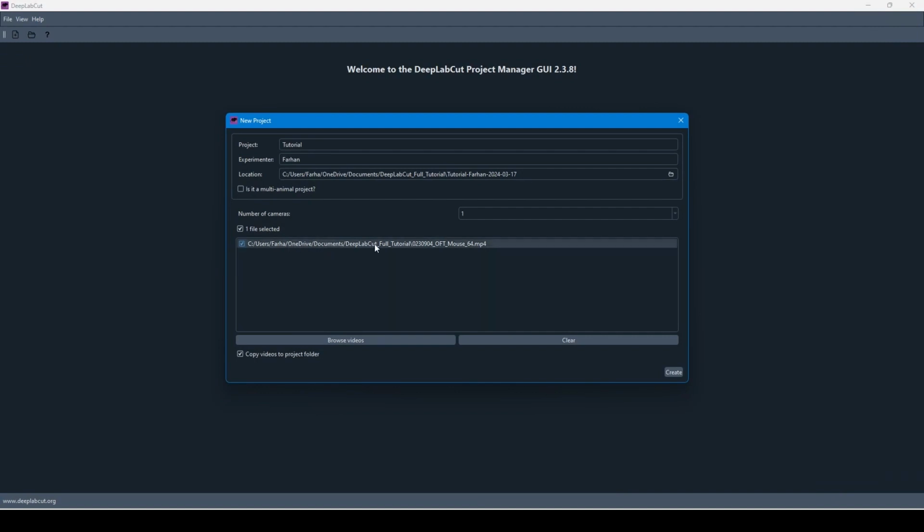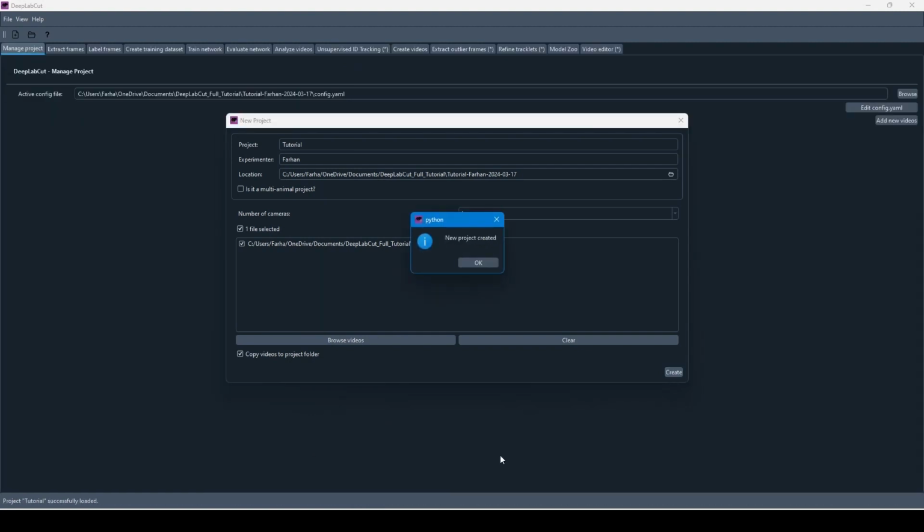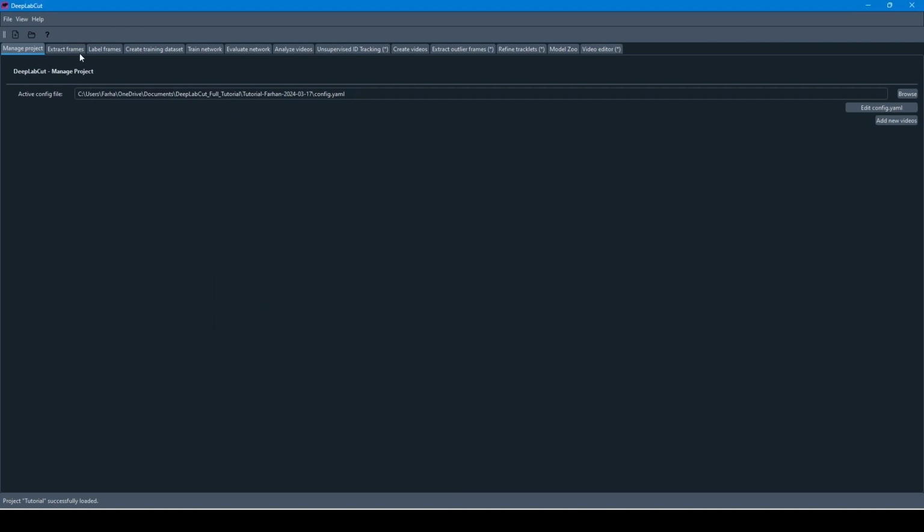So that is my video over here. It's going to get copied into my project folder. I'm only utilizing one video for the sake of this tutorial. So when your new project is generated, you get a new project created message. We need to go ahead and describe our body parts.